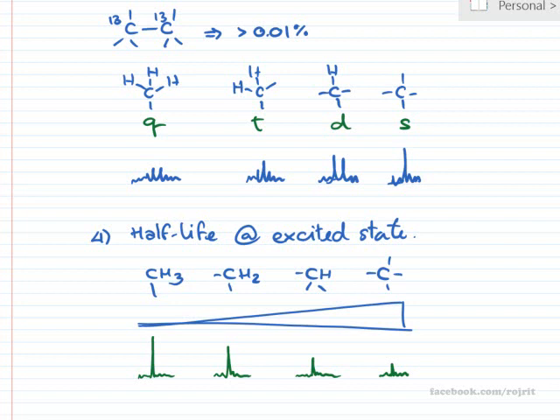But if we excite carbon up to the excited state, when it goes back down, we collect the data, right? But it takes time to let your carbon go back down to the ground state. It's a very long time. So normally we will not wait until every carbon atom comes back down to the ground state and then re-excite for the second time. We may just let it come back down for 1-2 seconds and then excite it again, right? Only that 1 or 2 seconds.